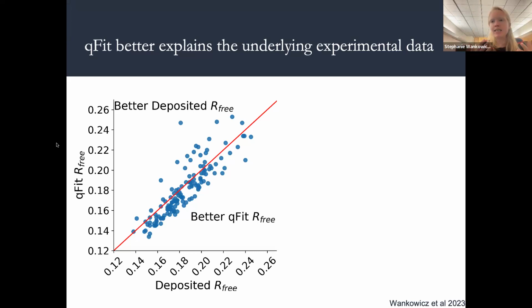And by not modeling the structural ensemble, we're really leaving a lot of experimental data on the board. And if we think about this one step further, most protein prediction algorithms are using just these models to then understand protein function, to understand the structure of proteins, to understand all of these different metrics. If we're not encoding this structural ensemble into our models, we're not actually explaining the structural ensemble of proteins.